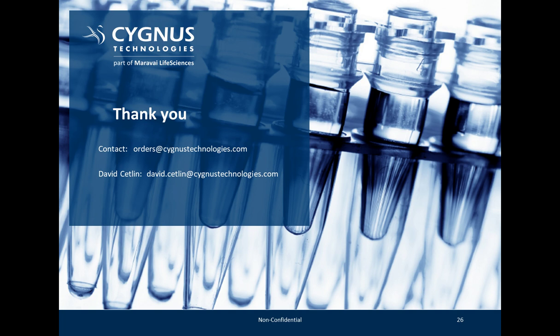The assumptions that we built into the kit were that loads would be 150 mils, and we'd provide you with enough particle to spike 150 mils 10 times at a concentration of 10 to the 9 particles per mil. So just to reiterate, if your load is going to be spiked to 10 to the 9 particles per mil, and you have 150 mils of that spiked load, you can run 10 experiments in that mode.